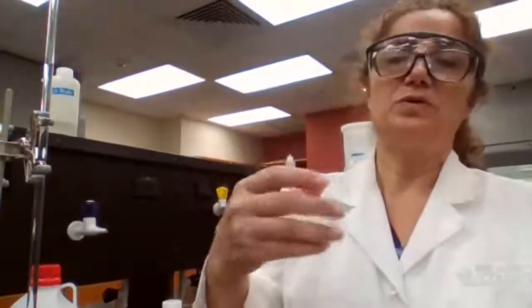For practice, the idea is to see how benzoic acid, or carboxylic acid in general, is going to dissolve in water or not, if it's going to dissolve in sodium hydroxide or not, and then if it does dissolve in sodium hydroxide, then we test with sodium bicarbonate. The reaction with sodium bicarbonate is slower, but when you see those bubbles forming, that means it's dissolving or the reaction is taking place.